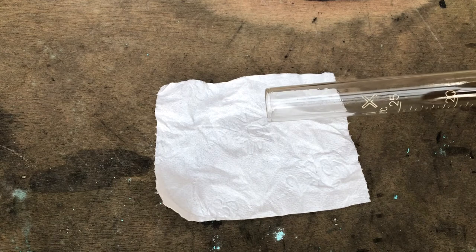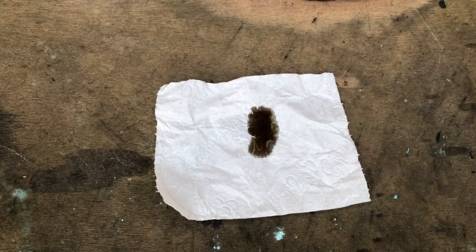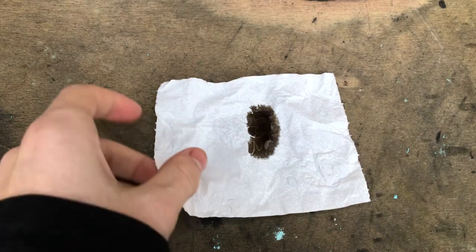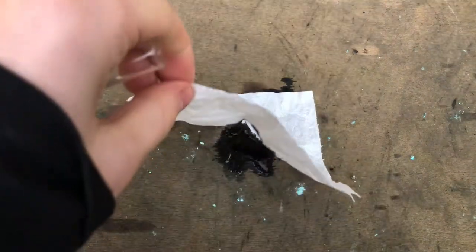It's quite concentrated. To test if the sulfuric acid is concentrated, I wanted to see how fast it dissolves cellulose — my source of cellulose is just toilet paper. As you can see, the sulfuric acid turned it black and ate right through it, so it must be quite concentrated.